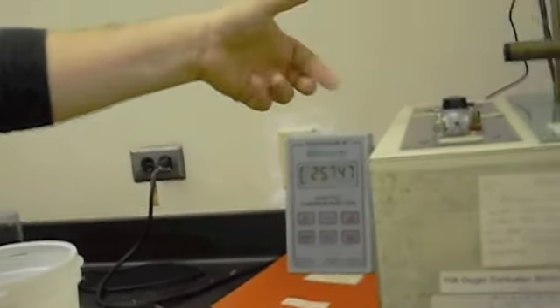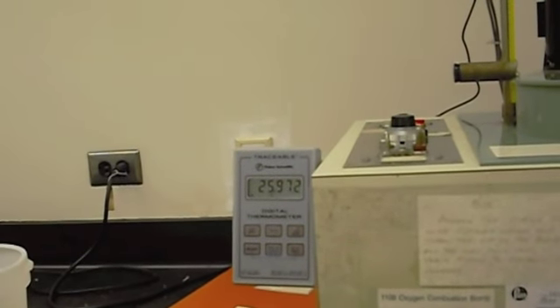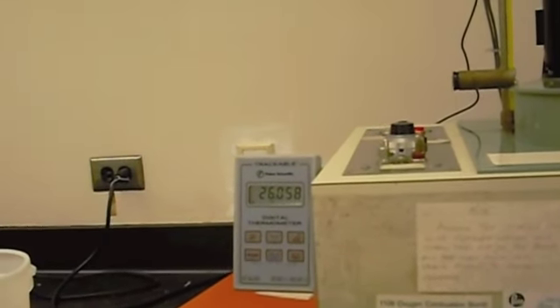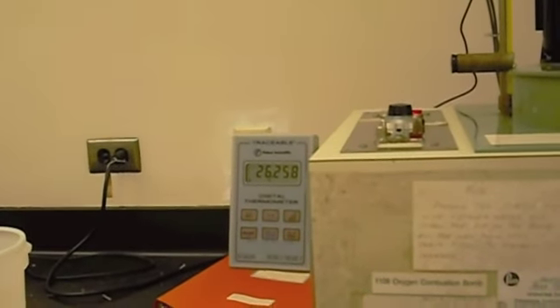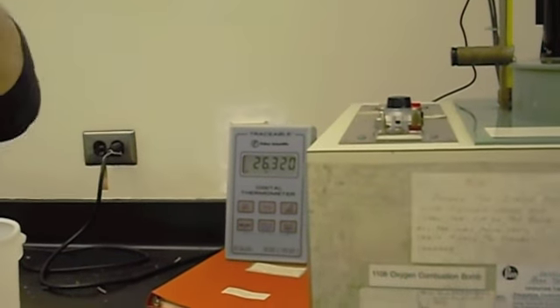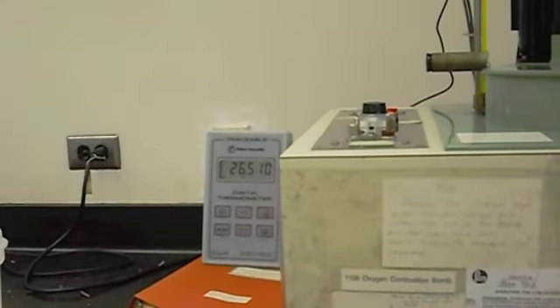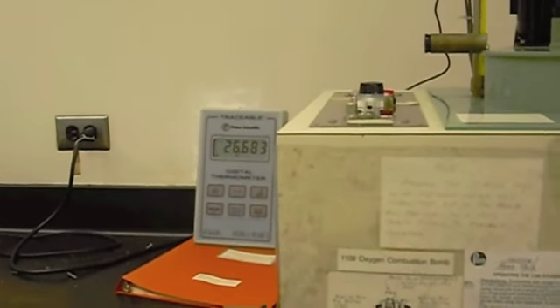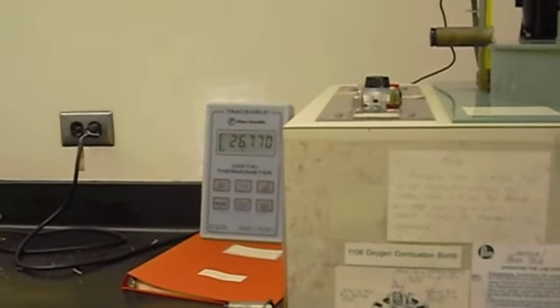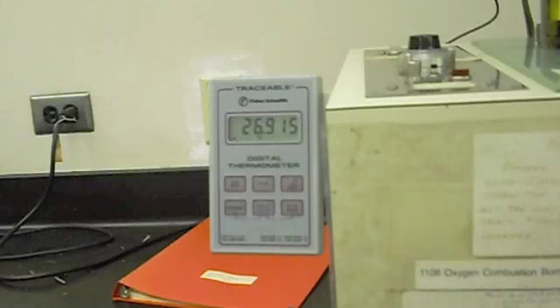Seven. See, now you can hear that clicking. It's starting to track it. And of course, what I didn't do was write down the temperature. In the protocol for the experiment, you establish the temperature baseline at several points in time before and then after the firing. So you try to keep a continuous temperature time plot in your notebook. And then at time zero, you fire, and then you measure the delta T after that. And so, yeah, it's climbing right up. So we had a successful firing.